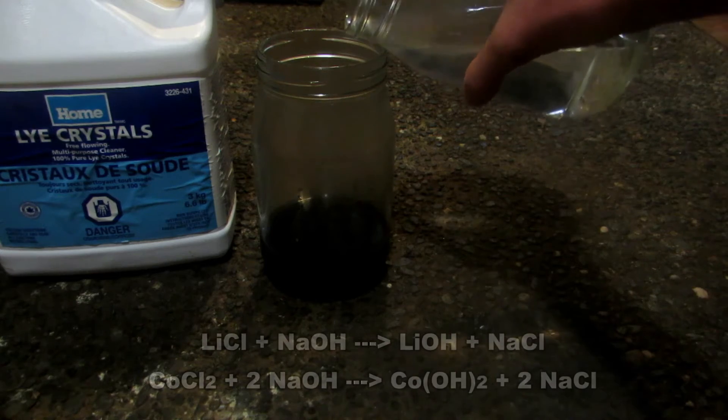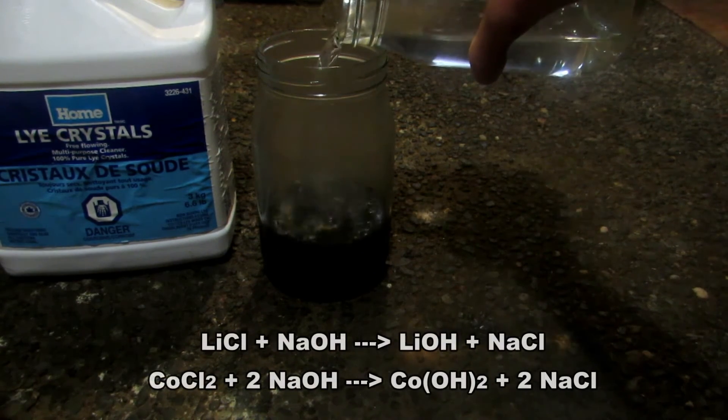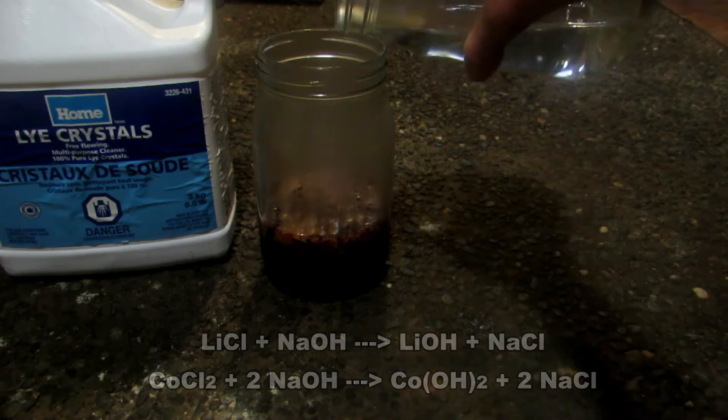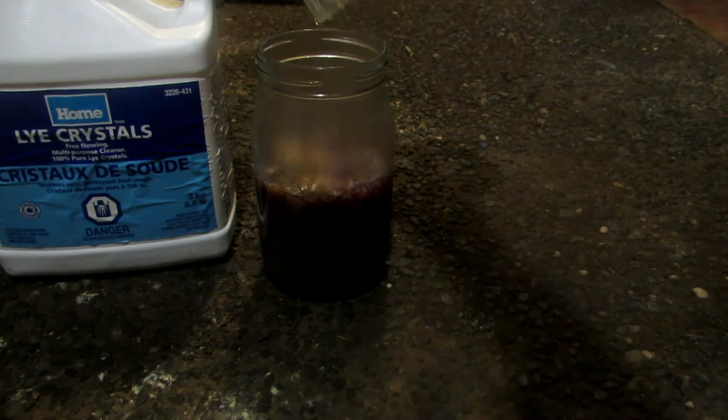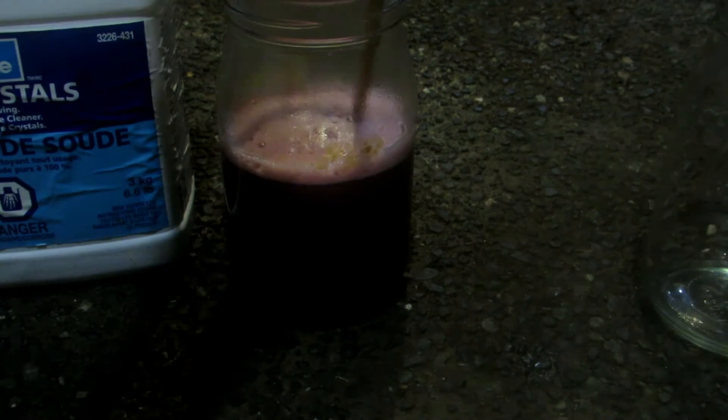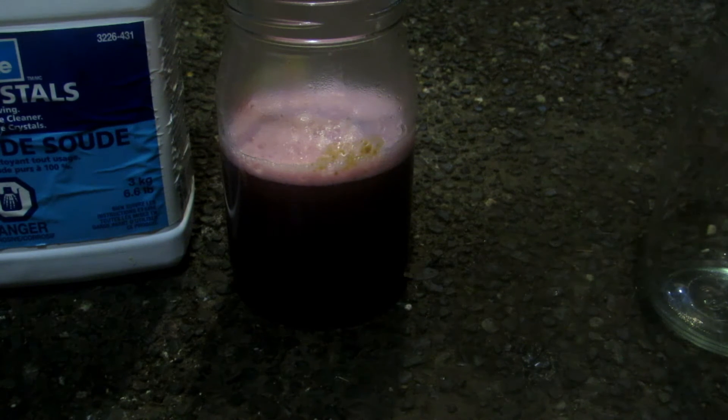Upon addition of sodium hydroxide, you should see a precipitate forming — a light pink color. We've clearly formed a lot of precipitate. Mix thoroughly to ensure everything reacts well, then filter this off. After filtering we'll obtain cobalt hydroxide and a solution of lithium hydroxide, which can be used in the future to recover lithium metal. It's now a nice purple solution — I'm not totally sure of cobalt hydroxide's color, but it appears to be purple.